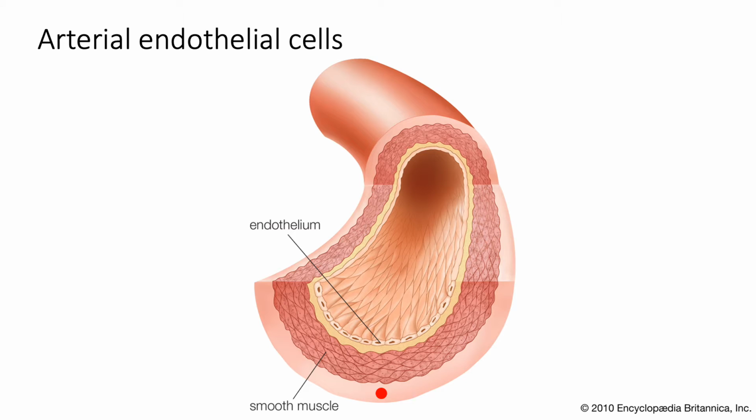We study endothelial cell metabolism due to endothelial cells' importance in maintaining cardiovascular homeostasis. Endothelial cells are often studied by culturing commercially obtained immortalized cells. However, studying primarily obtained endothelial cells might provide a better insight into vascular biology because primary cells are exposed to the hemodynamic and metabolic stresses of the body.